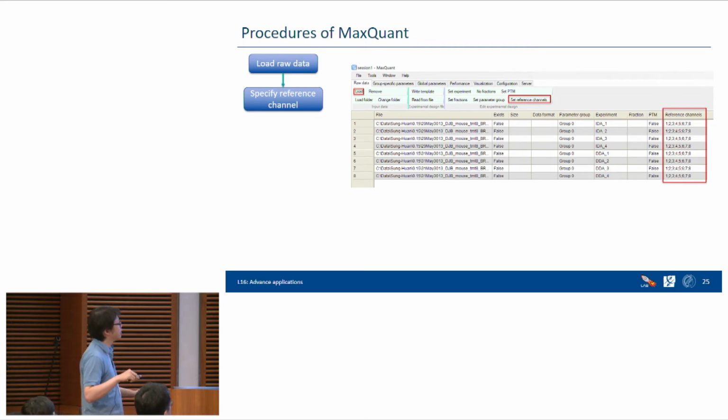Then we check the variance: at 0 days they are not really improved, at 10 days it starts to decrease a little bit, and at 20 days it significantly decreased. So that means for this peptide 1 gene, the influence of this knockout starts to appear maybe after 20 days.